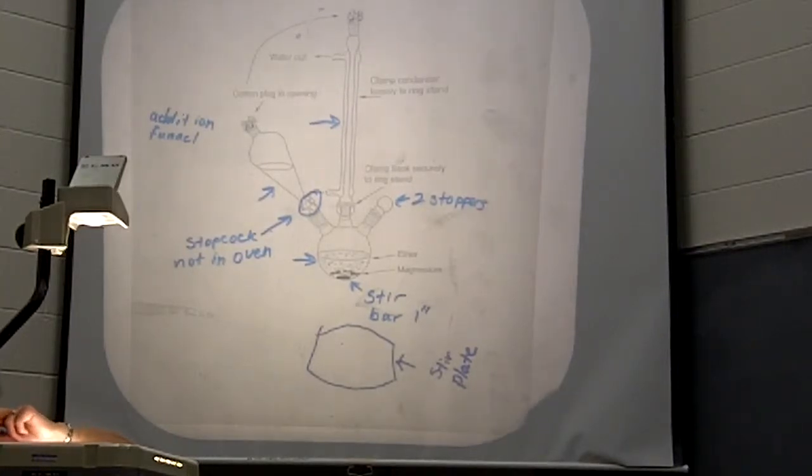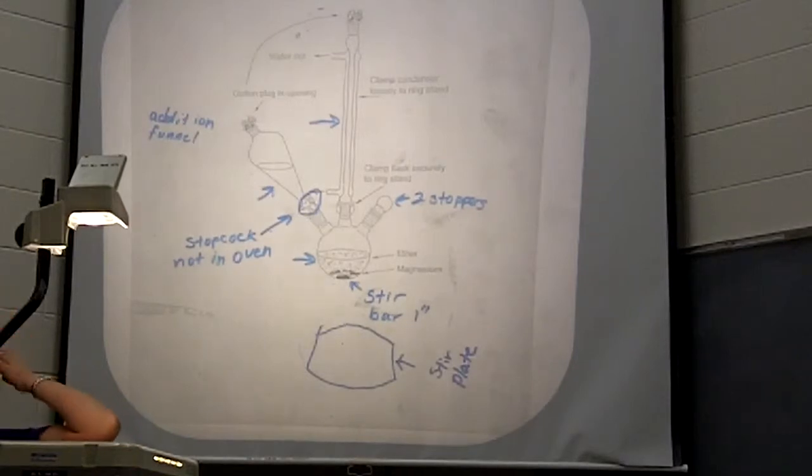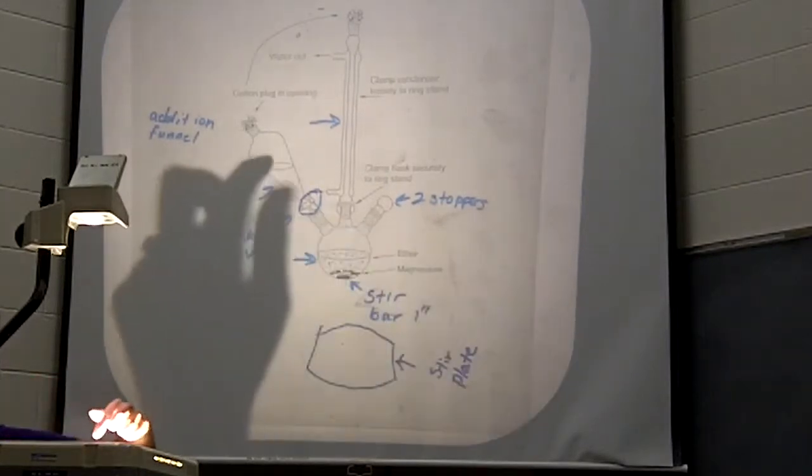If you don't make the right products, we probably won't have GC standards to help you analyze your product, okay? So you all are going to make a specific set of products that we will analyze by GC, but you need to make the right thing. So read labels very carefully.